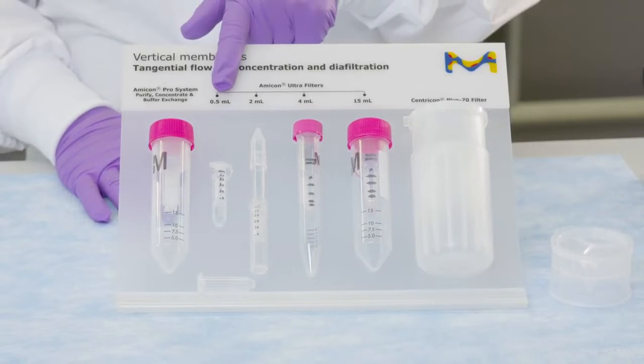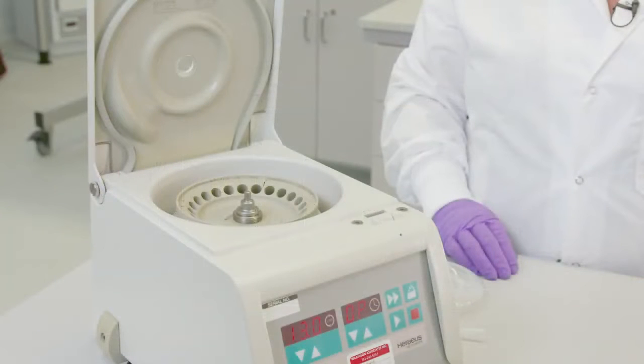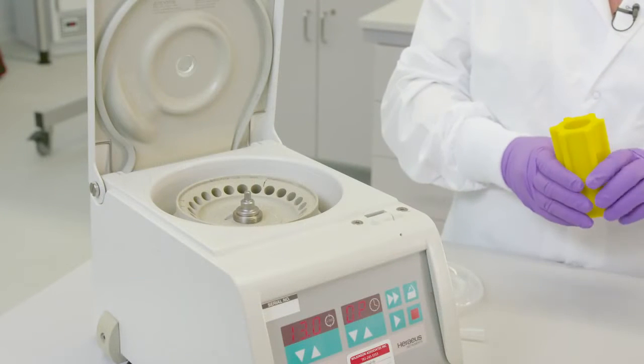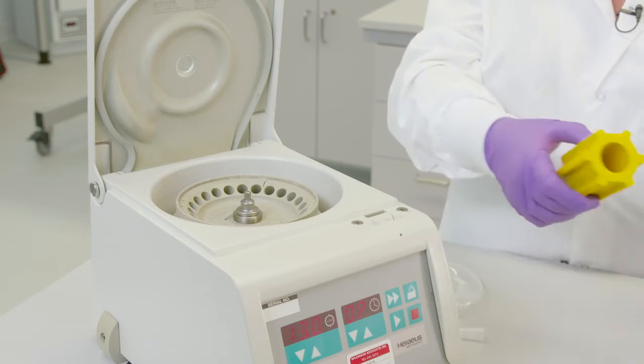The Amicon family can accommodate processing volumes from 0.5 mil to 70 mil. Some rotors do not need rotor cushions in the base, but those that require these ensure the geometry will accommodate the shape of the bottom of the filtrate tube.